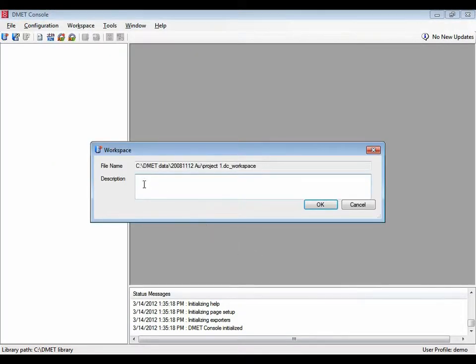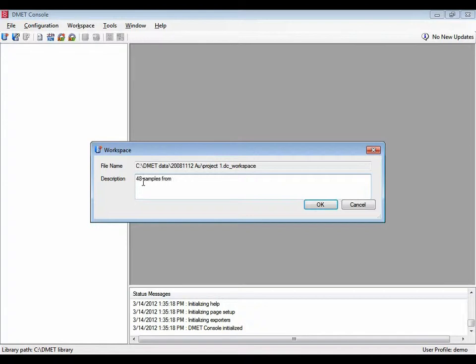If we have to manage multiple workspaces, it might be helpful to describe what content it has. Let's say, samples from a u set.